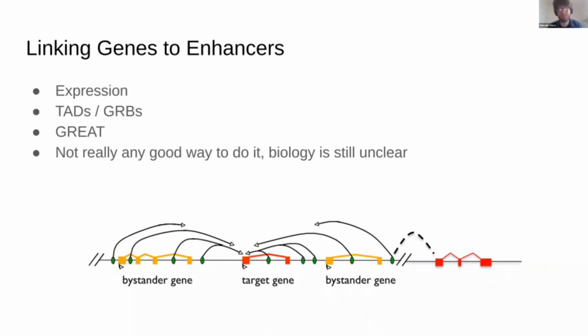But yeah, one obvious thing would be, if you have an oocyte enhancer, to look not just at the nearest gene, but at the nearest gene that's expressed in oocytes, so any nearby expressed genes. That's probably important. Another way of looking at it is in genomic domains. If you're lucky enough to have a species where you've got TADs or Hi-C data, that's information about how the genome is compacted in space. That can be interesting because it's probably not the case that enhancers are contacting genes outside of their own TADs.